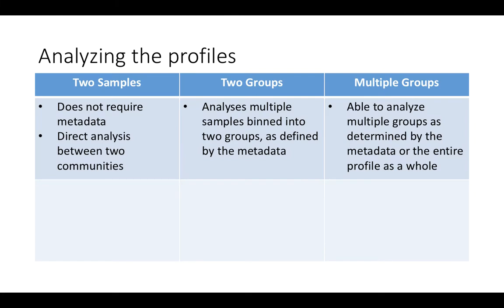Using STAMP software, you can analyze your profile in one of three levels. At the two-sample level, you can do a direct analysis between two communities — notice that this is the only level in which you do not need to input a metadata file for your analysis. At the two-group level, you can analyze multiple samples binned into two groups, as defined by your metadata. And at the multiple-group level, you can analyze more than two groups, or you can look at your sample as a whole.